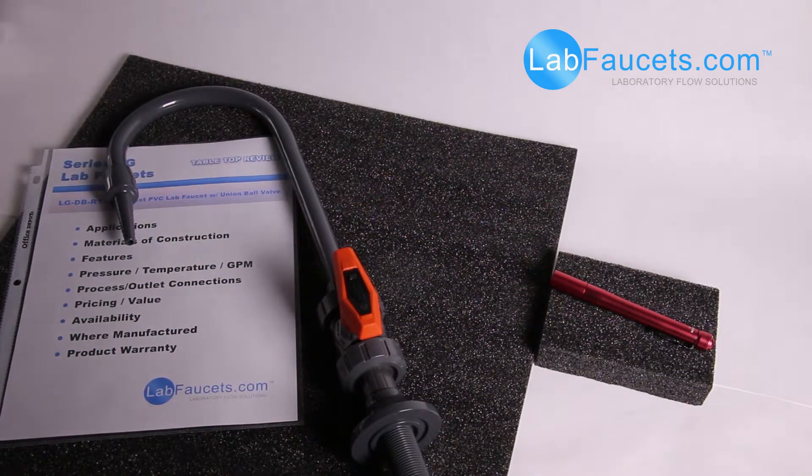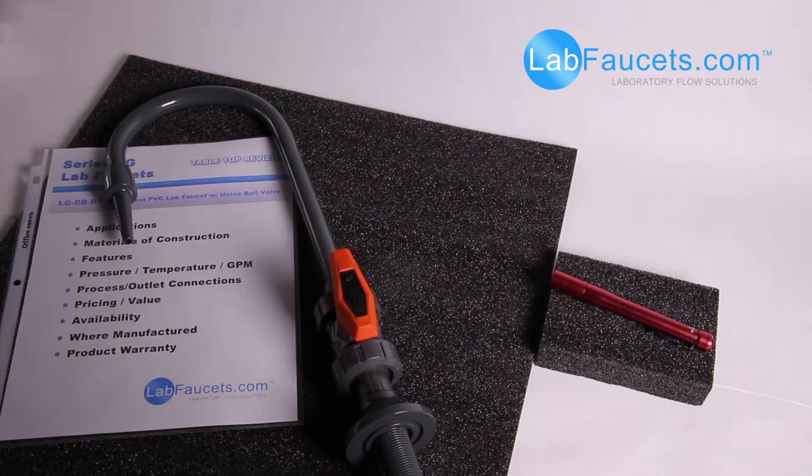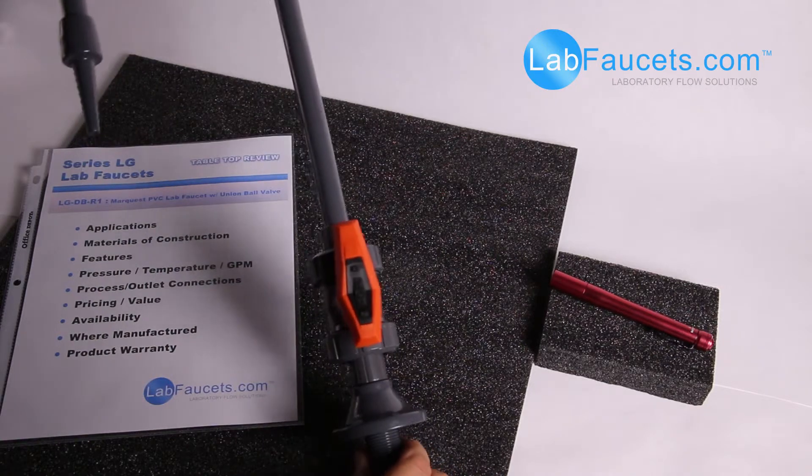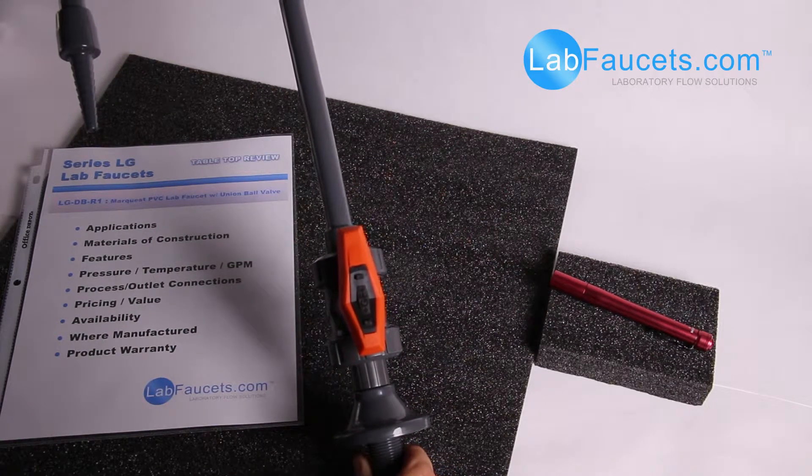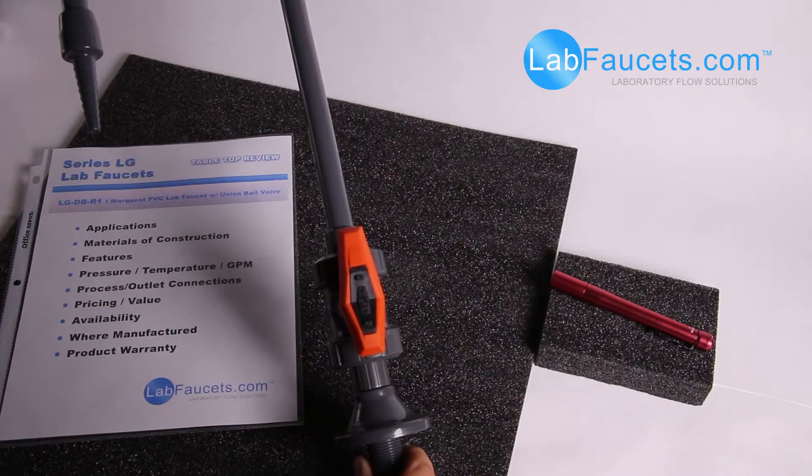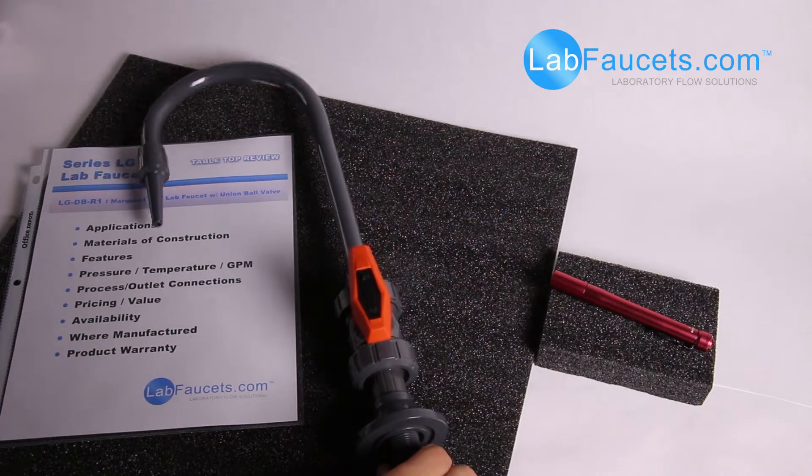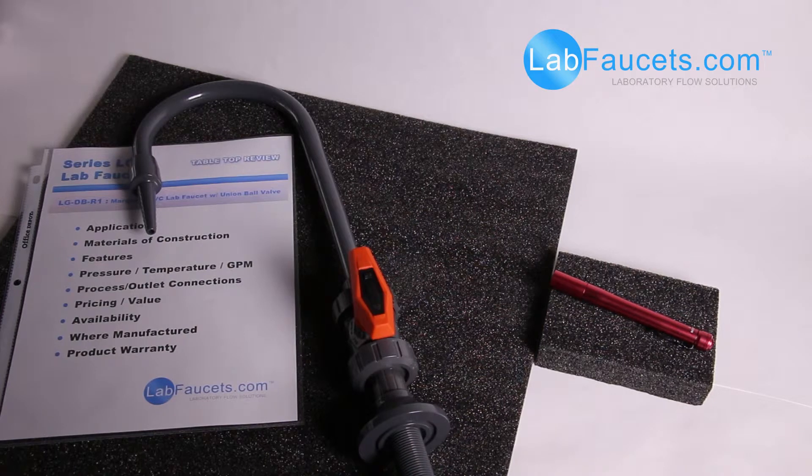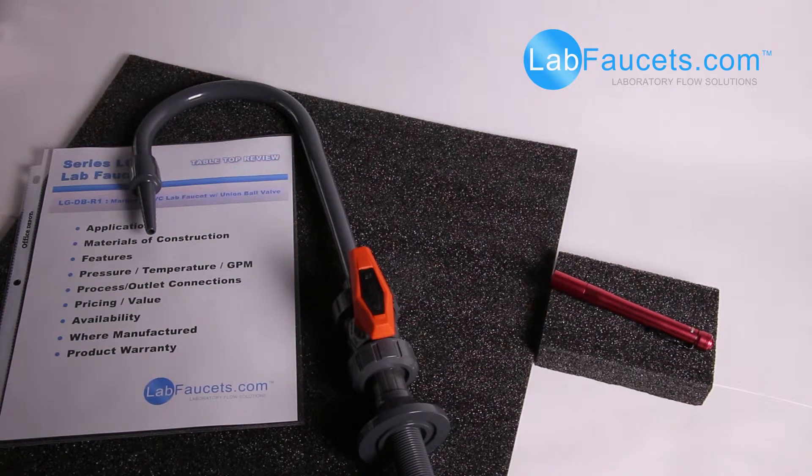Pressure, temperature, and gallons per minute. This faucet has a maximum operating pressure of 150 PSI at ambient temperature. Gallons per minute, this faucet at 73 PSI, 74-75 PSI city pressure, will dispense approximately 6.3 to 6.5 gallons per minute.